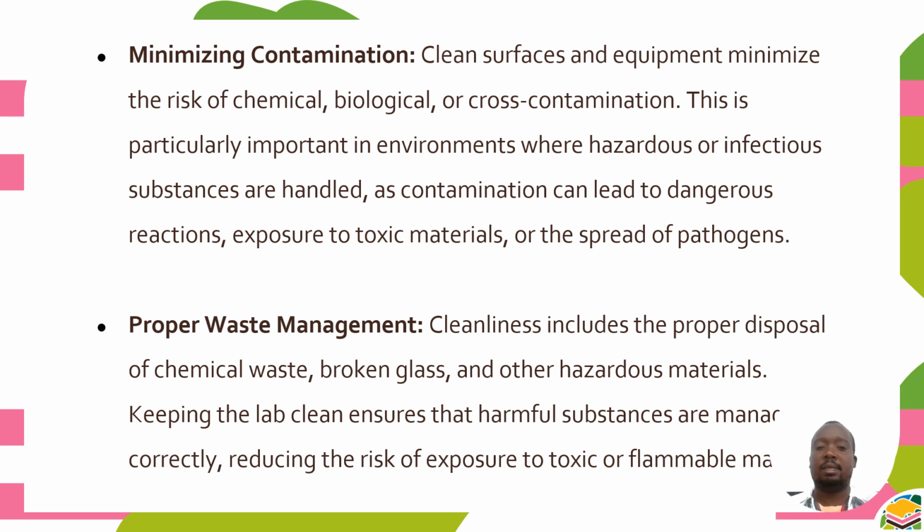This is particularly important in environments where hazardous or infectious substances are handled, as contamination can lead to dangerous reactions, exposure to toxic materials, or the spread of pathogens.